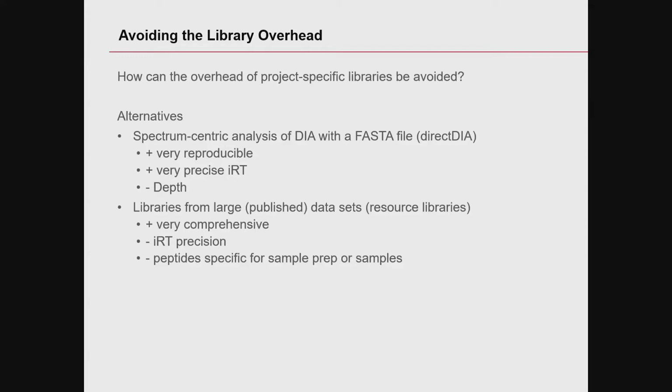The advantage here is that it really gives you very, very reproducible quantitation. And that's a side note. You will also have very precise iRTs because they're actually determined on the same runs as you do your experiment. So there's usually not so much variation in chromatography within your experiment. Otherwise, it would probably not be optimal. The downside is that you don't get such a big proteome coverage as you could otherwise. It also gets a lot better actually recently, but the depth is a little bit limited.